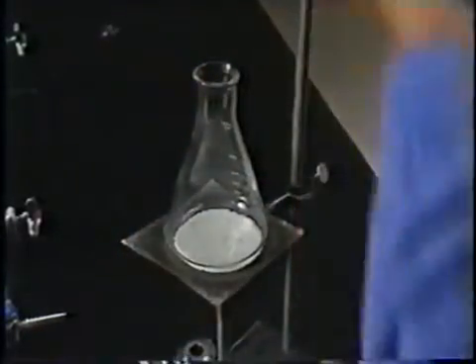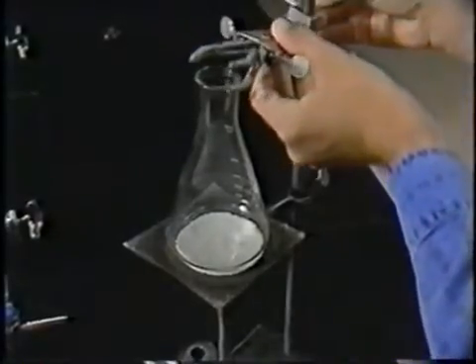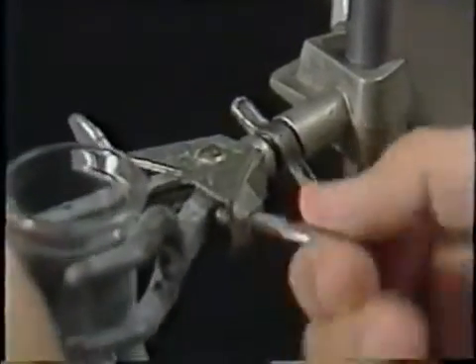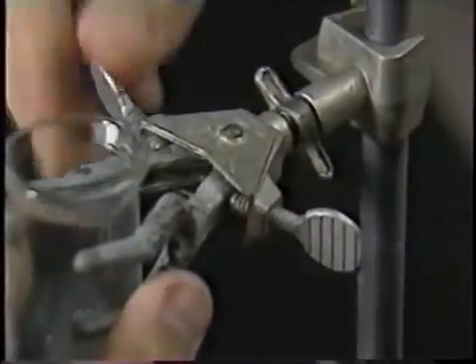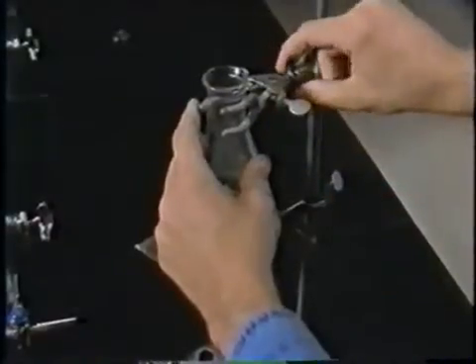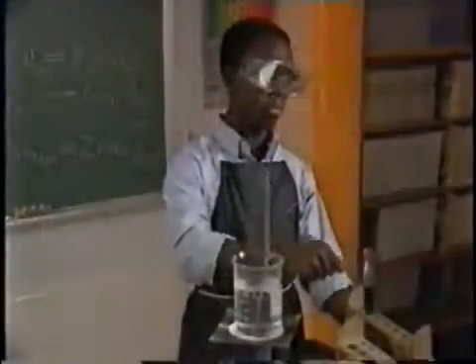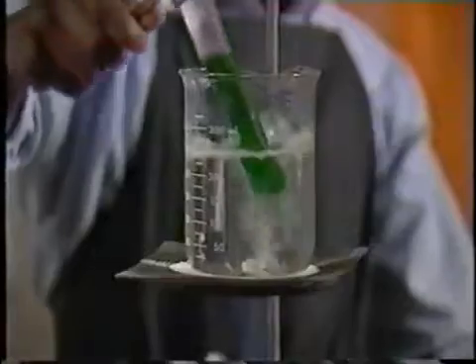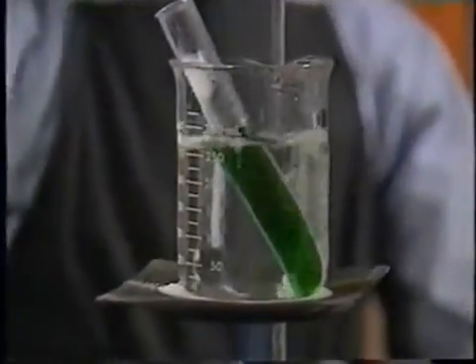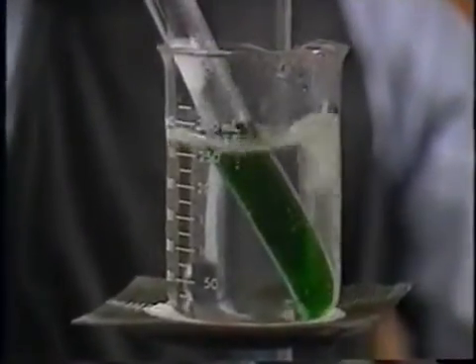Flat-bottomed containers are normally heated on a wire screen on a ring stand. Erlenmeyer flasks and other narrow-necked containers should be secured to the stand with a clamp. Test tubes can be heated in a water bath. The water bath transfers heat slowly and evenly to the test tube and helps keep it from boiling over.